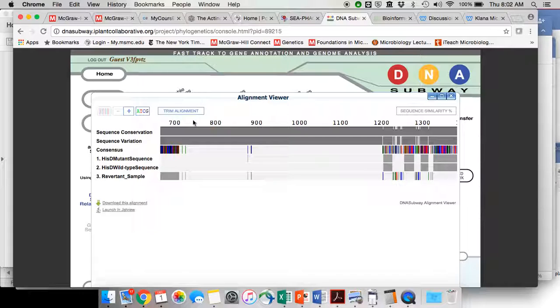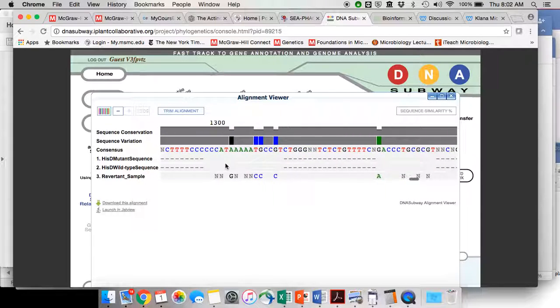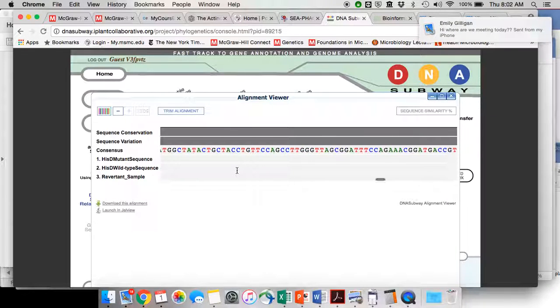And you can see the nucleotide numbers are up here, so it's going to be probably these colored bars right here. It's a little easier to click on the ATCG to look at it, and then we're going to look for approximately nucleotide 893 up top here.